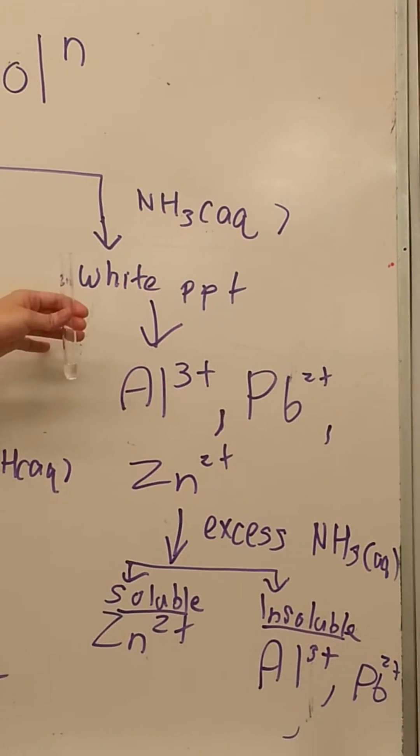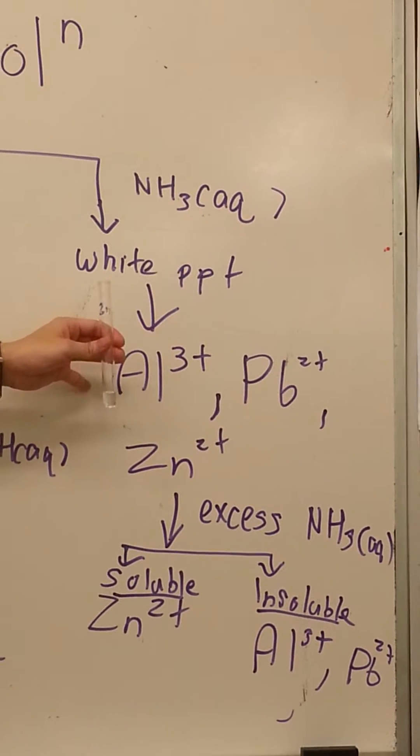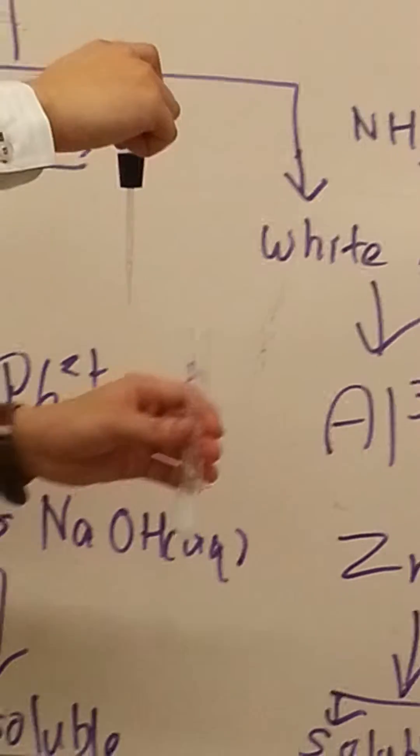Right now I will attempt to test for zinc using aqueous ammonia. It will give a white precipitate when added in a normal one-to-one ratio. So aqueous ammonia is being used, and we see a white precipitate.